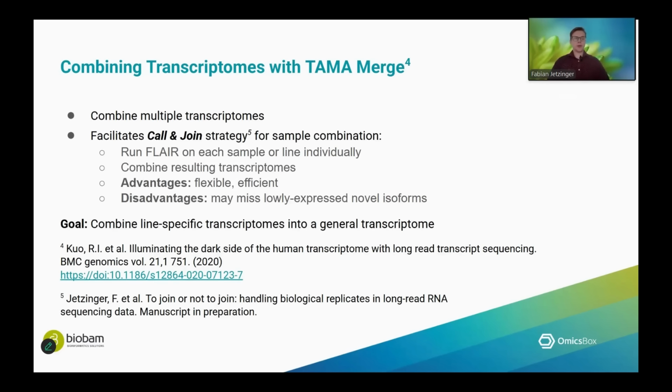So as we will be conducting this transcriptome reconstruction step on each line, we will then need to combine these transcriptomes into a more general sweet potato transcriptome, which we will do with TAMA merge, which is a tool which facilitates what we call a call and join strategy for sample combination.